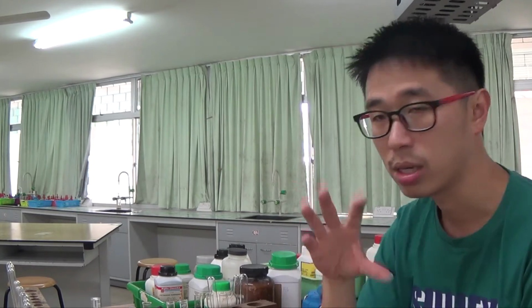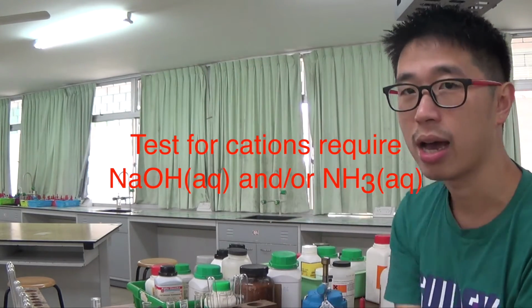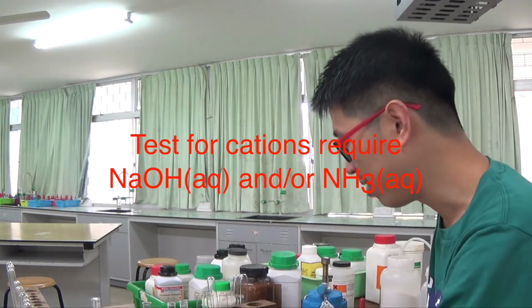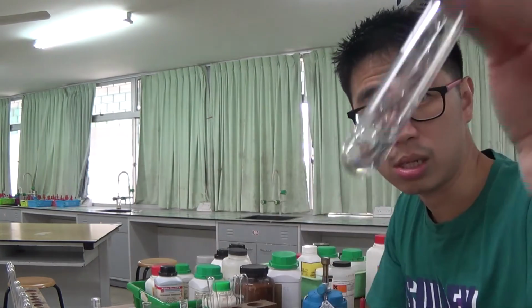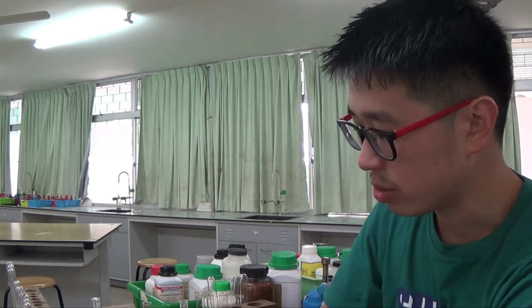Testing for cations. In your test for cations, you would know that you have a table where you have adding sodium hydroxide and then adding ammonia. Okay, so that is exactly what we're going to do. So I've got more portion of the solution that I need, but anyway. So when I add sodium hydroxide, so this is my solution, okay, another portion of that solution. So I want to add sodium hydroxide.